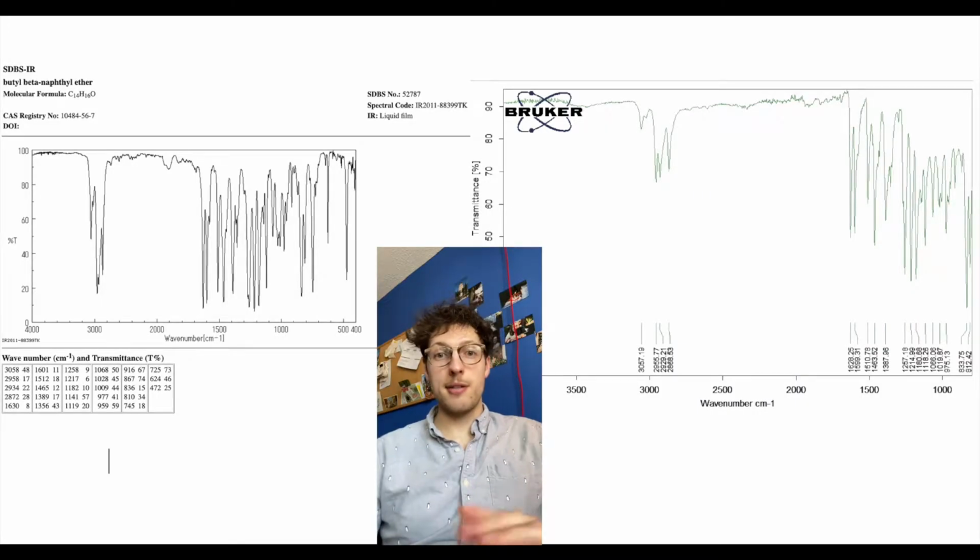All right, so now we're going to be getting into the analysis of the product of 2-butoxynaphthalene that we created. We're going to use the IR spectra data that we had collected and also look at the TLC plate that was made. So we're going to just scoot over here. All right, so looking at the spectral data that we have available to us, one collected at the very end of the procedure where we use vacuum filtration to isolate the crystal solids of the 2-butoxynaphthalene.